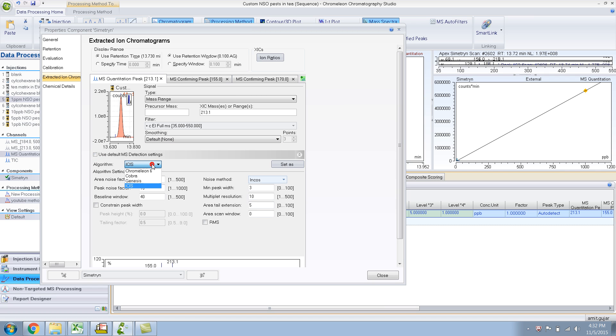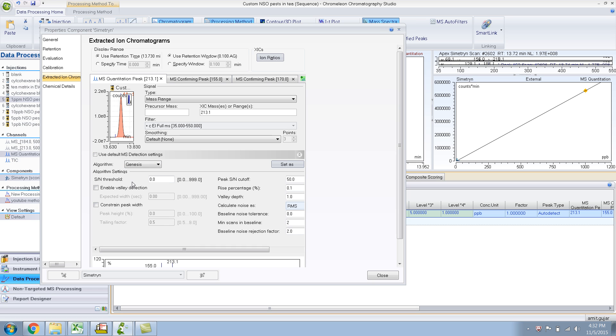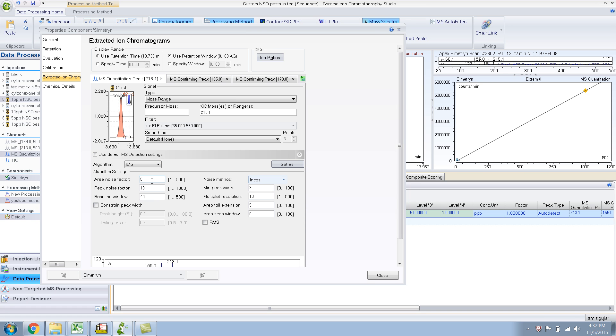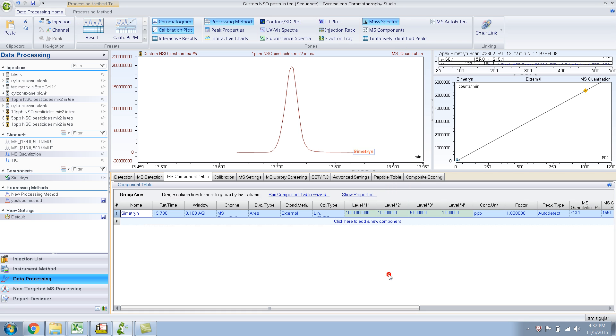Sometimes this is important because different extracted ion chromatograms have different shapes and different signal to noise, and it calculates a bit differently, each of these algorithms. So sometimes ISIS is not the best. Sometimes you have to use Cobra or sometimes you have to use Genesis. You have to take a closer look at your own data.